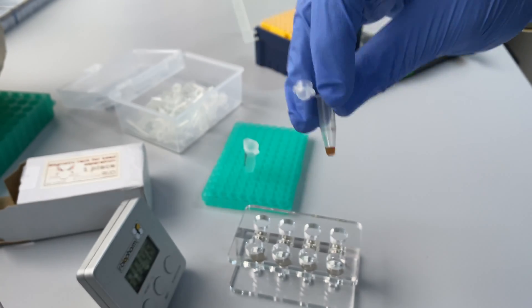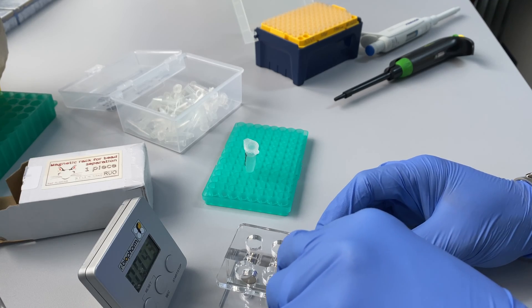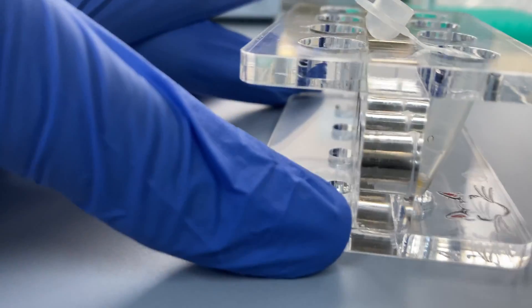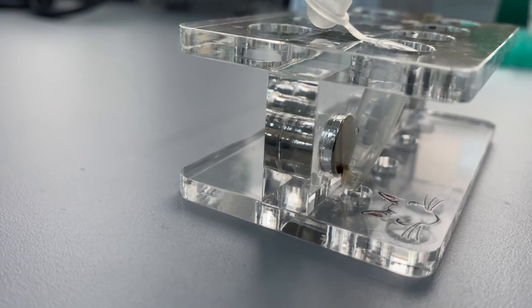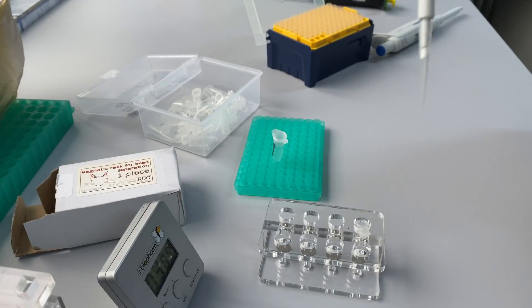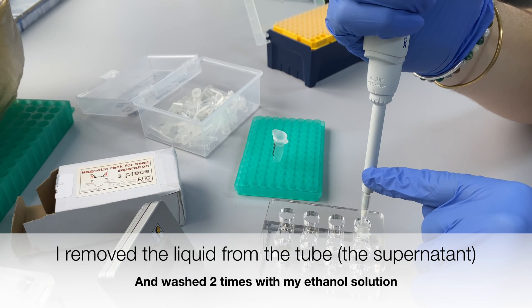Now that the beads finished incubating, I placed them on the magnetic rack for separation. As you can see, the DNA bound to the magnetic beads goes to the side of the tube. I then removed the liquid from the tube, leaving the beads untouched.